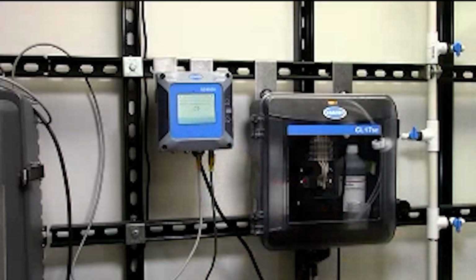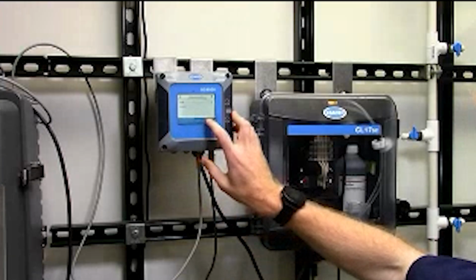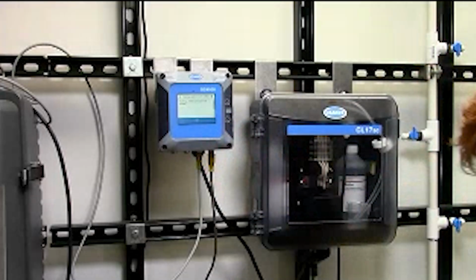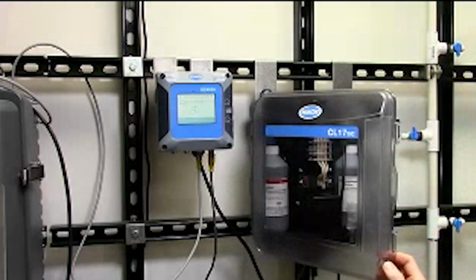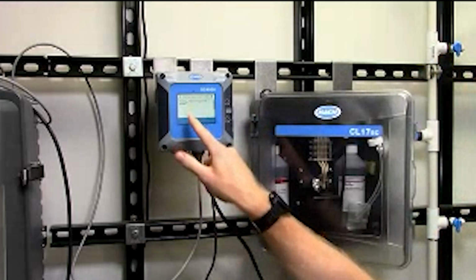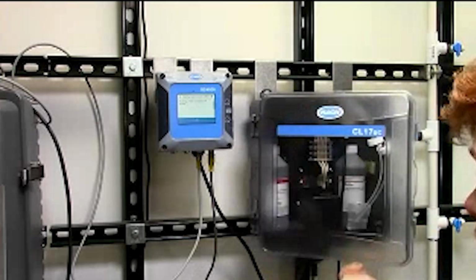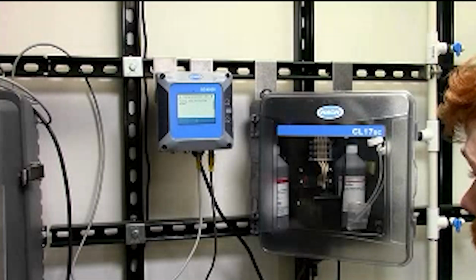So I'm going to go ahead and click OK here. And I want to make sure I'm in an output mode hold. Typically, whenever we're doing maintenance, we don't want any of these values to be sent out to our PLC or SCADAs. And while this is flushing my colorimeter cell, I'm going to make sure that my flow is turned off.